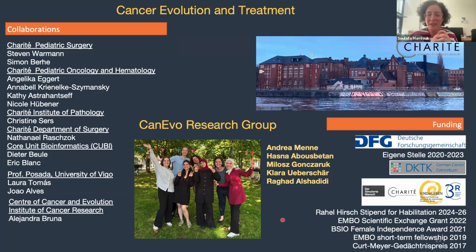In neuroblastoma, they are so delicate that we do a little bit of mechanical dissociation and then kind of leave them alone and hope that the tumor cells will be the ones that overgrow the population. And they have so far, except for one case where we also had a fibroblast line. Okay. Is that what you're at?